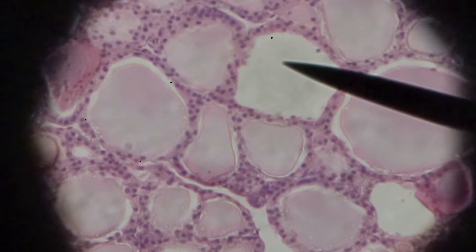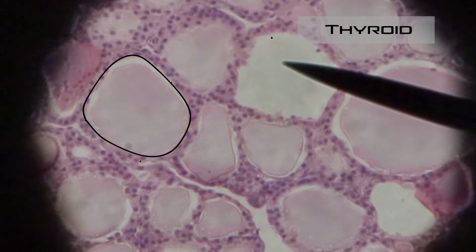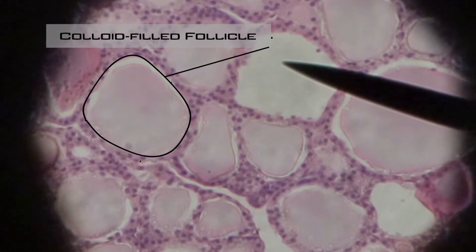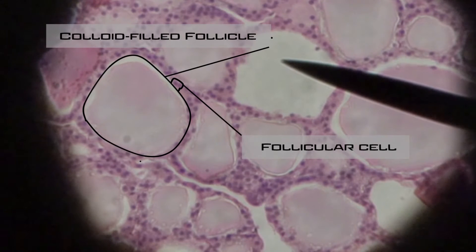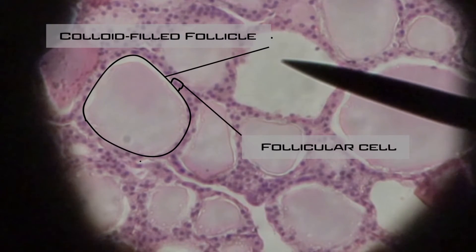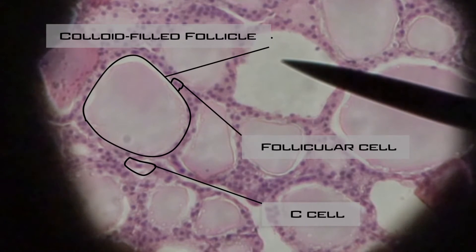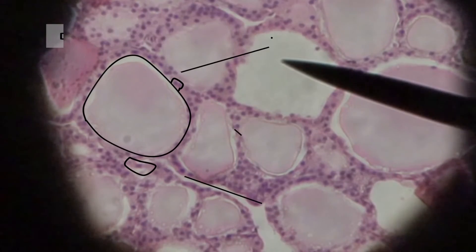Now we're looking at the thyroid and parathyroid slide. Looking at the thyroid first, you're seeing those colloid-filled follicles, and surrounding those follicles are the follicular cells. The follicular cells make thyroglobulin, which is stored as colloid inside the follicles. Thyroglobulin synthesizes and can also store the thyroid hormones. You can also see the C-cells between the follicles, which are responsible for making calcitonin, the hormone that helps regulate calcium in your blood.